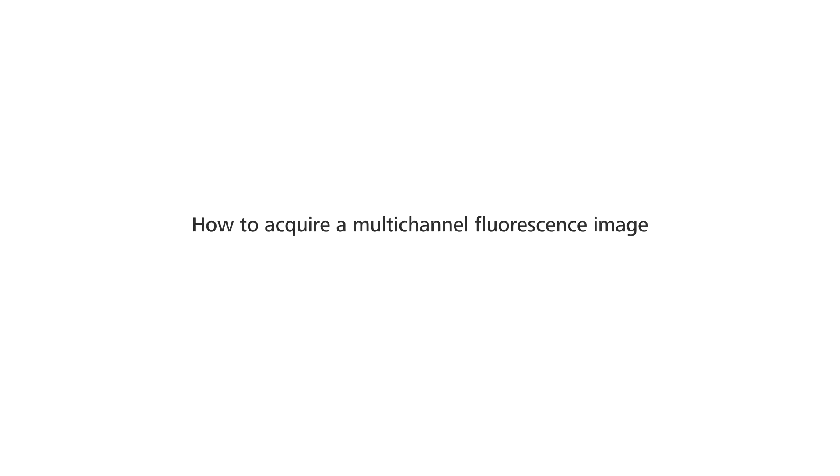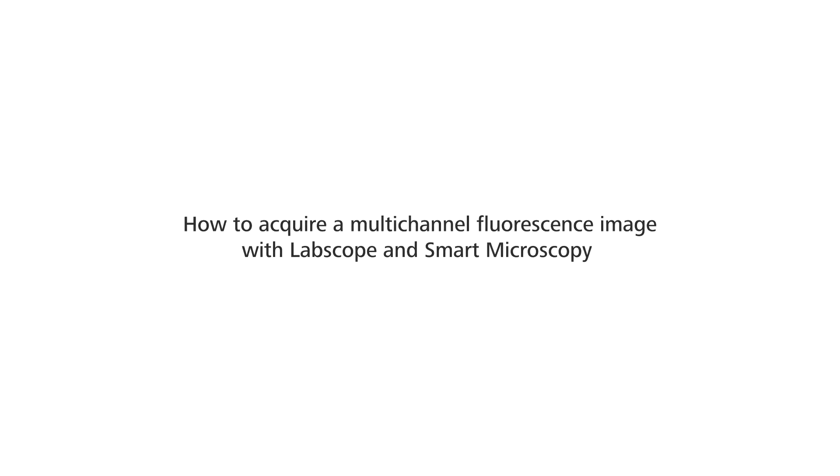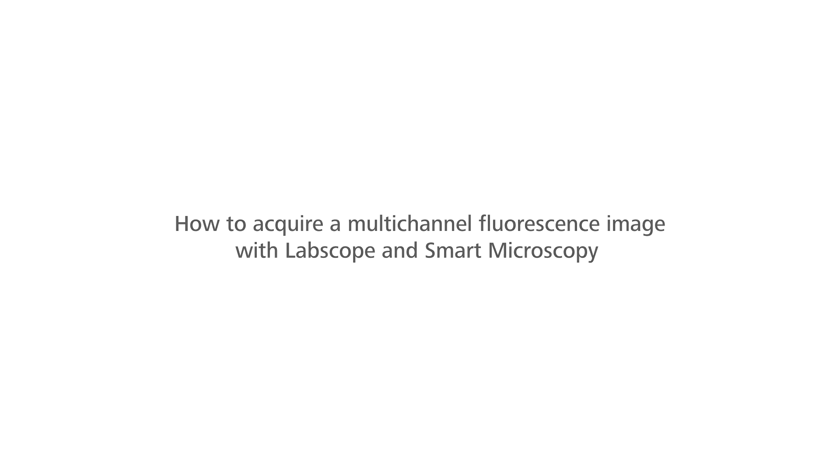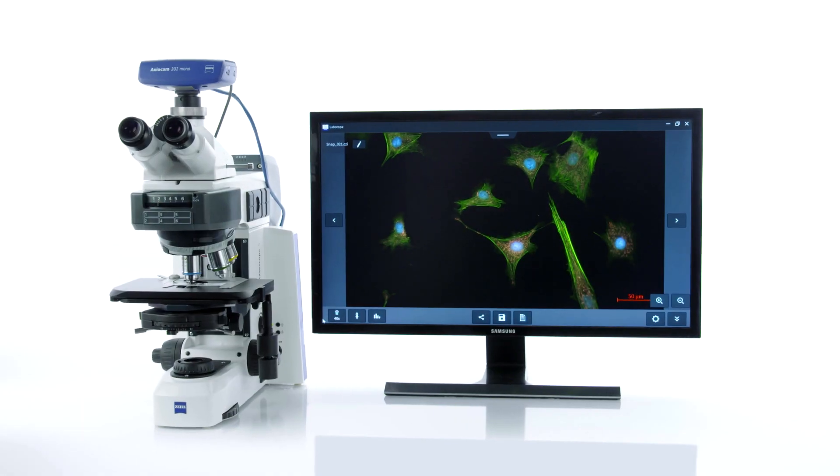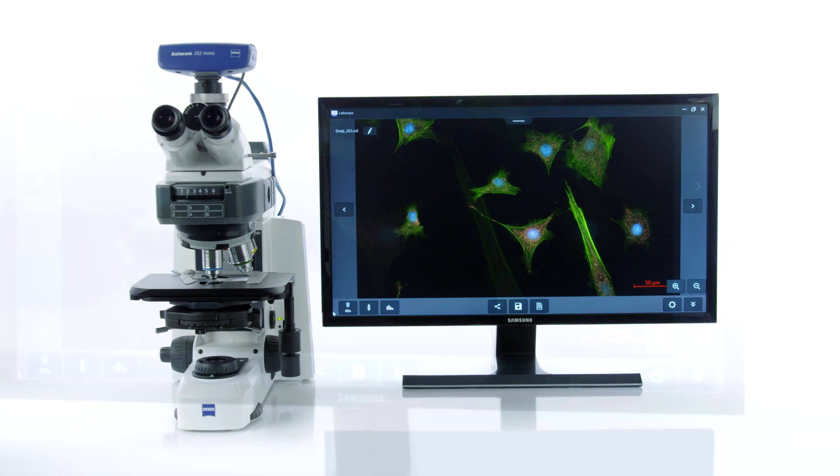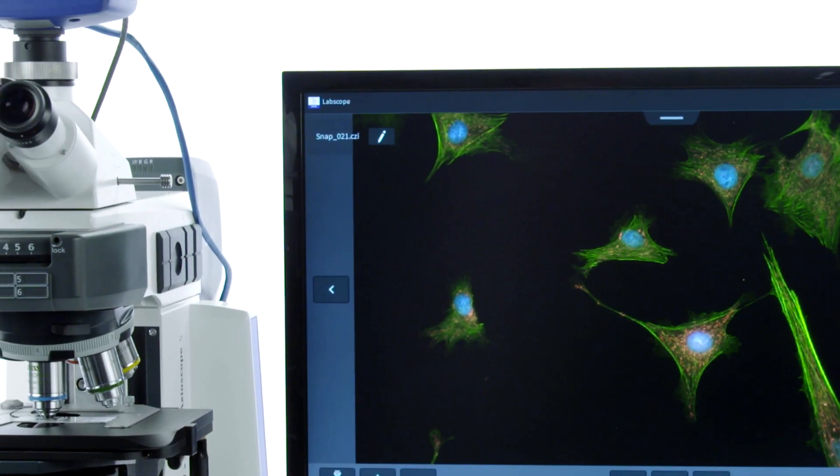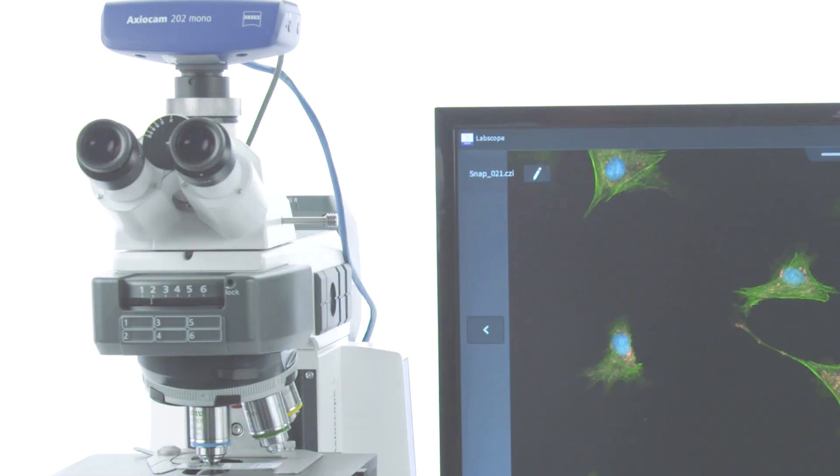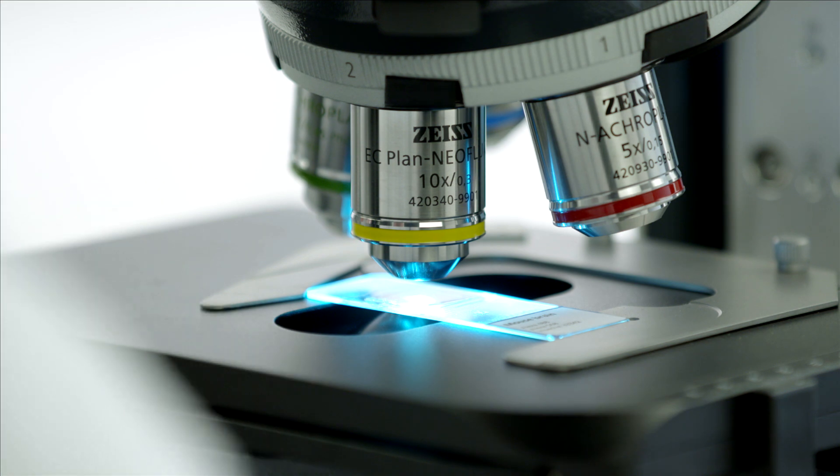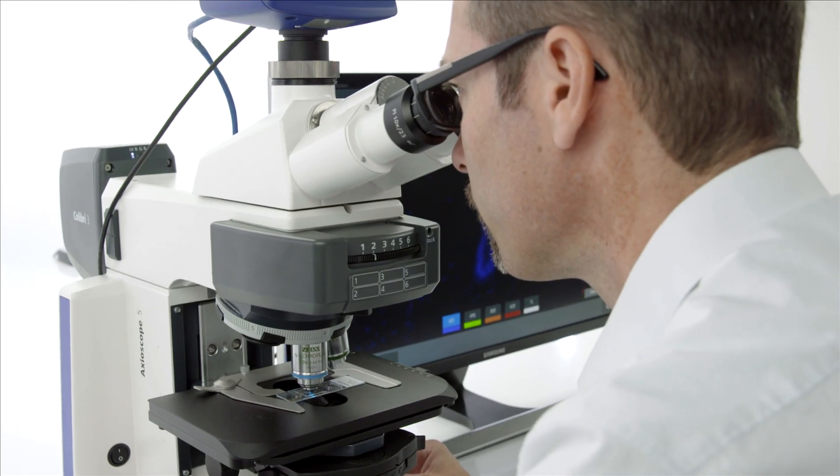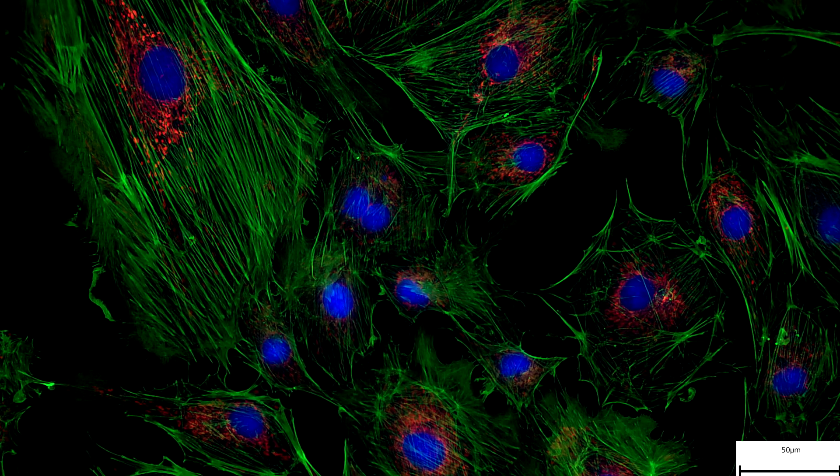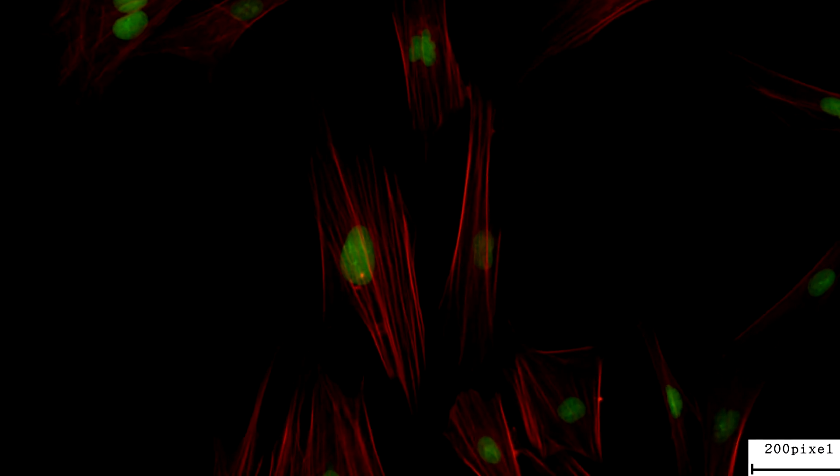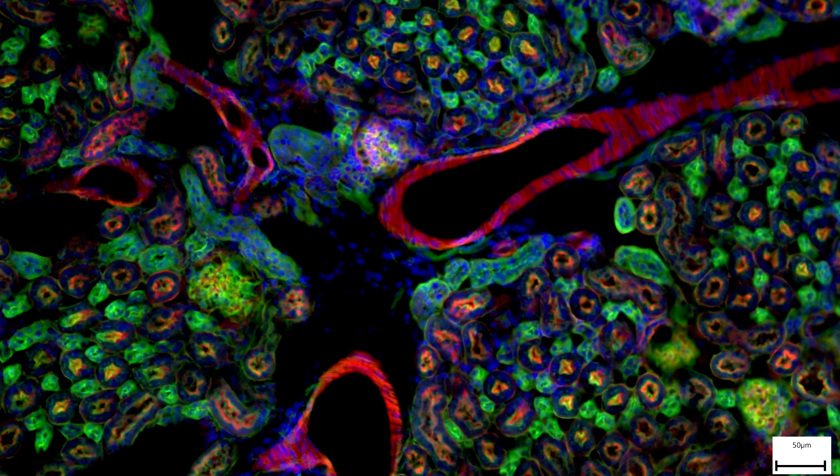How to acquire a multi-channel fluorescence image with LabScope and Smart Microscopy. If you work with fluorescently labeled cells or other samples that contain multiple fluorophores, easy image acquisition in independent channels and the overlay thereof is highly desired.